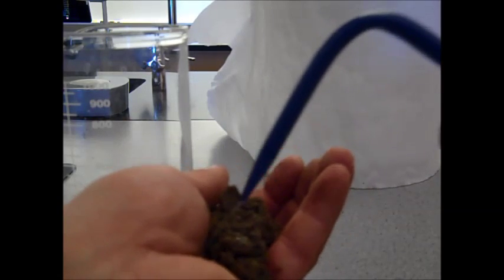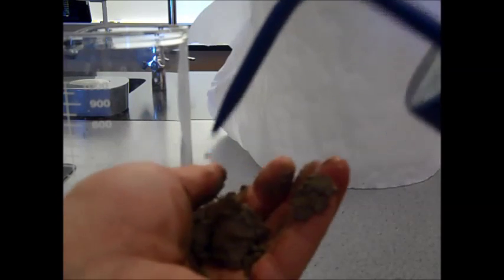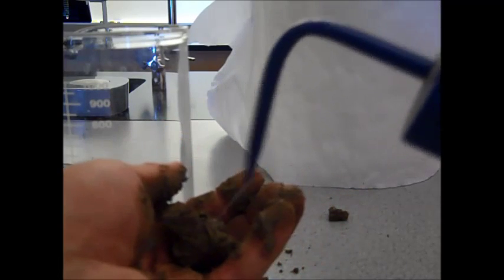The next thing I'm doing is I'm adding moisture here to my big piece. I'm making a ball, and I'm determining whether this ball can remain a ball in my hand. Again, this is testing for clay, and I feel stickiness in this soil. So yes, this soil is forming a ball. It's also called ribbon. Making a ribbon, I'll show you an example. You put it between your thumb and forefinger and you start to push.